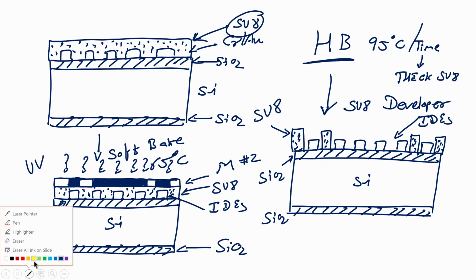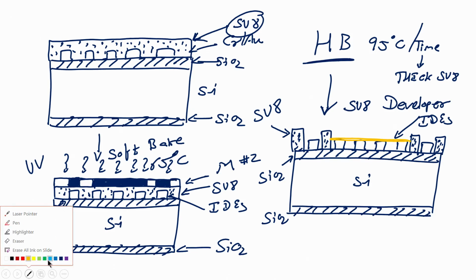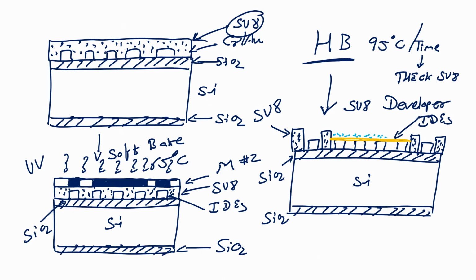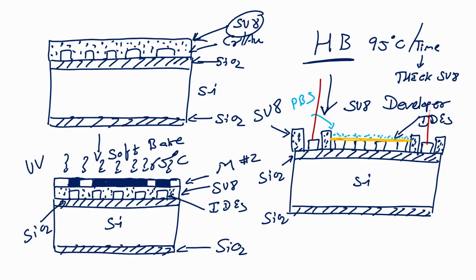We will place the tissue, and we will also use a solution to keep the tissue intact. That solution is our PBS. All right. Now, if I want to measure the resistance, I can measure between these two contacts.